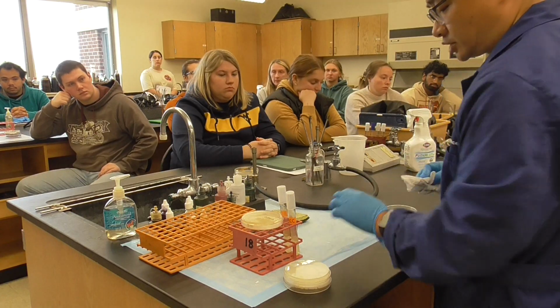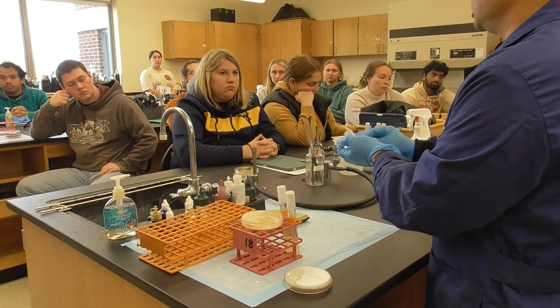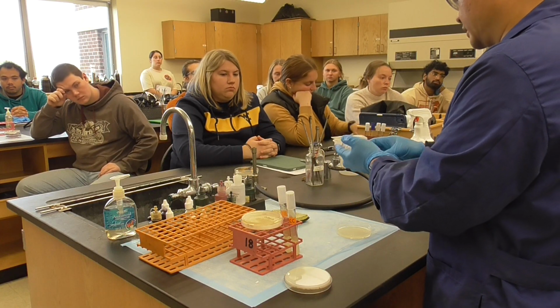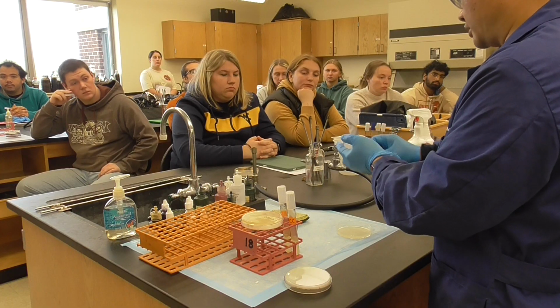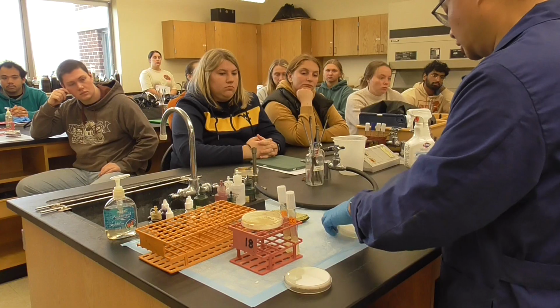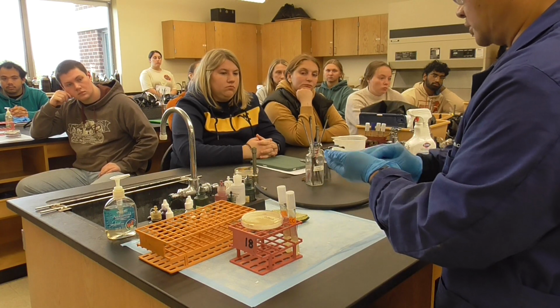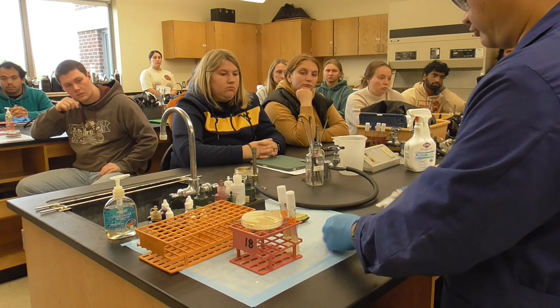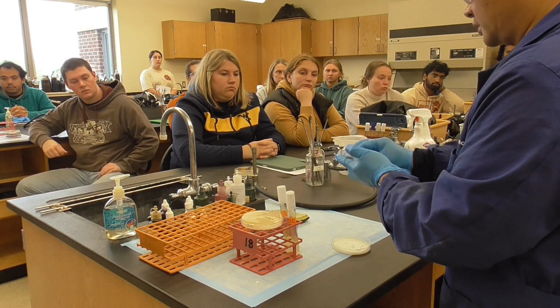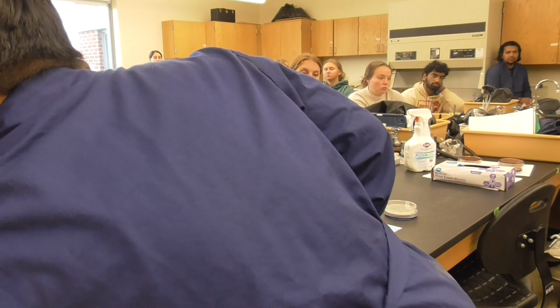A good thing is that this one is only for yes or no, which means there's a transparent zone or no transparent zone. It doesn't need to be that we see the population. It's a qualitative test, not a quantitative test. So first, clean it. It's very wet. When you have this, throw it away in the trash can.